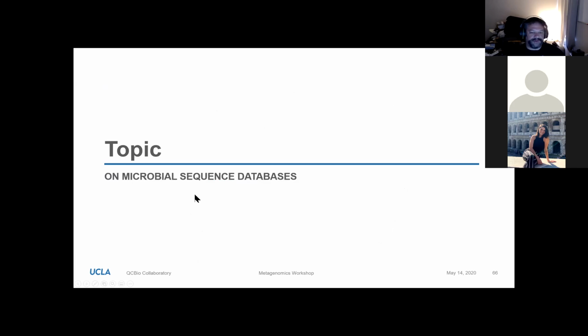Okay, and then one of the last things I'm going to go through is microbial sequence databases.